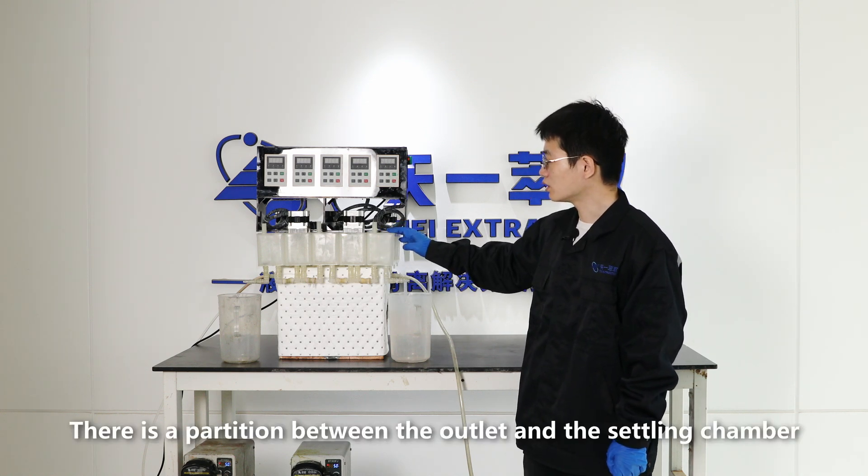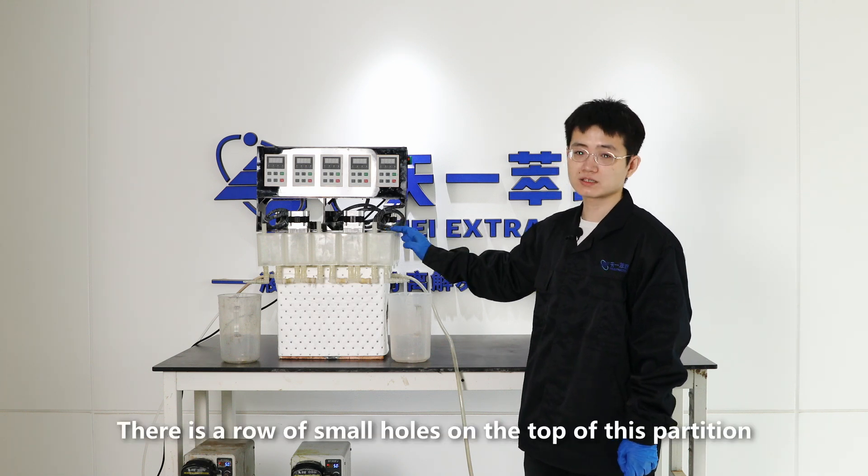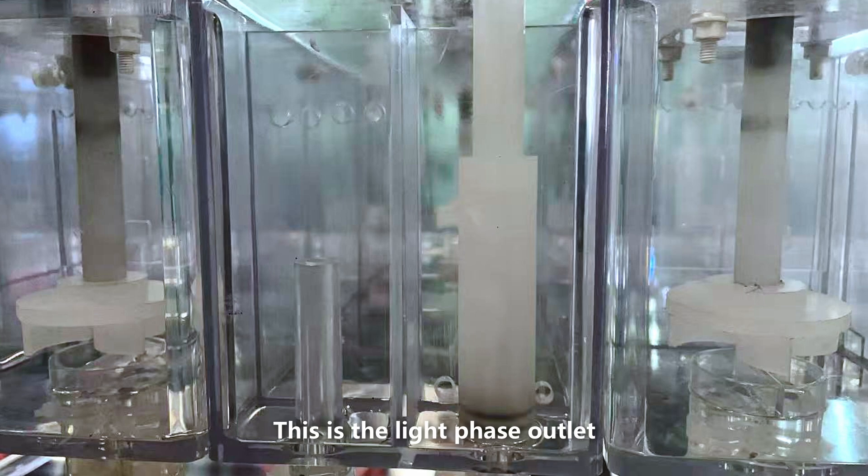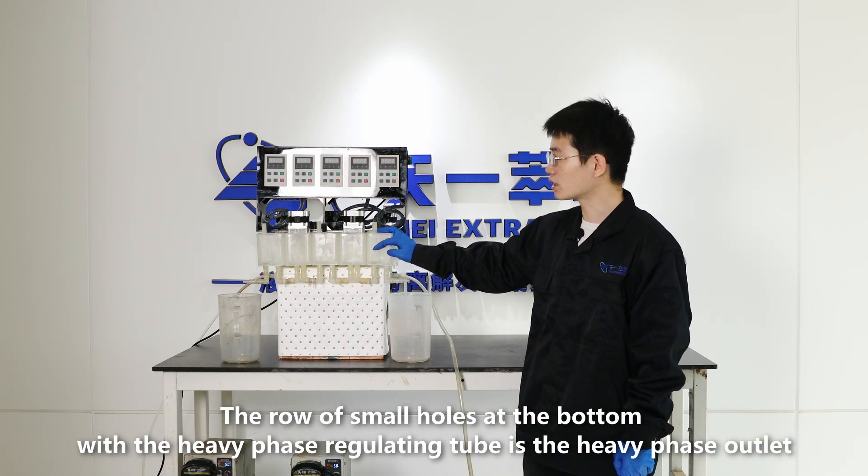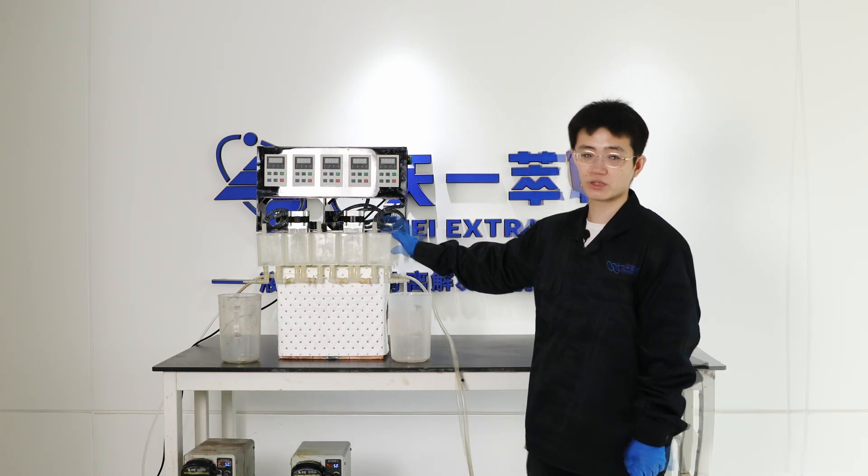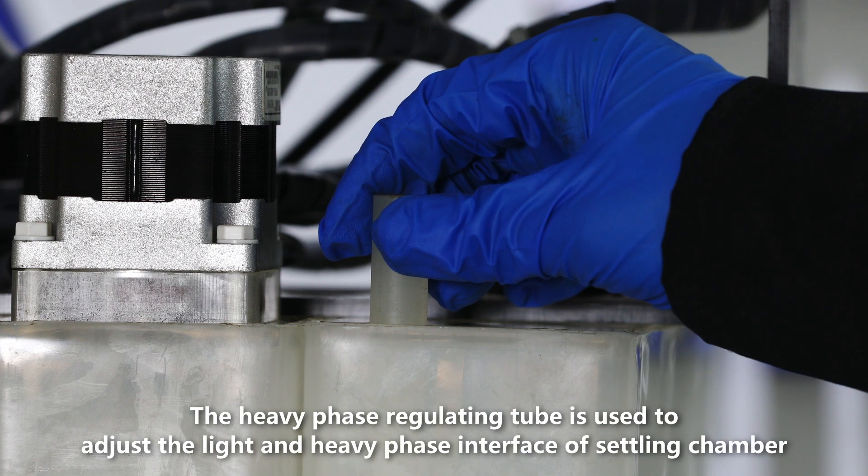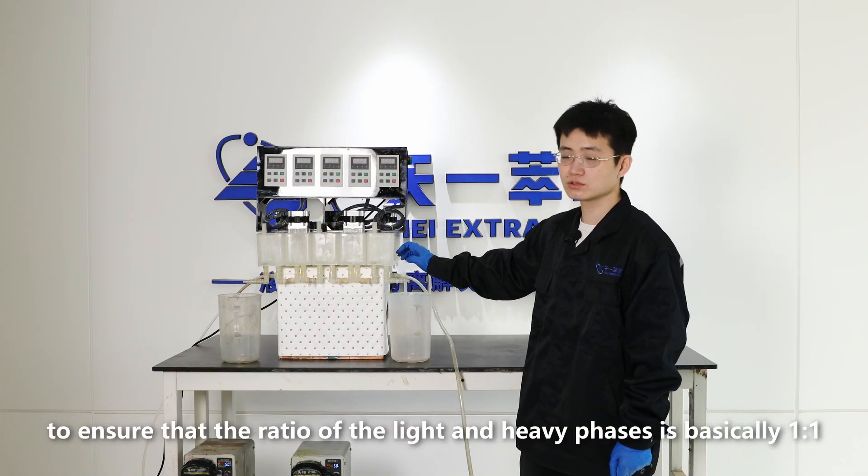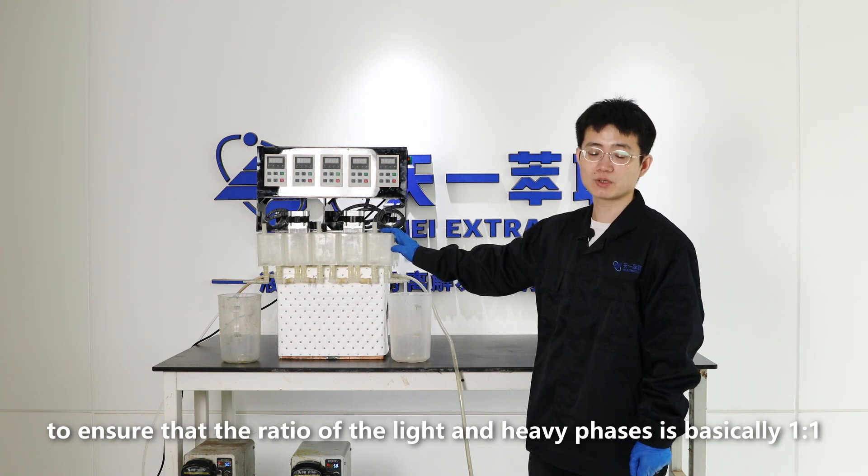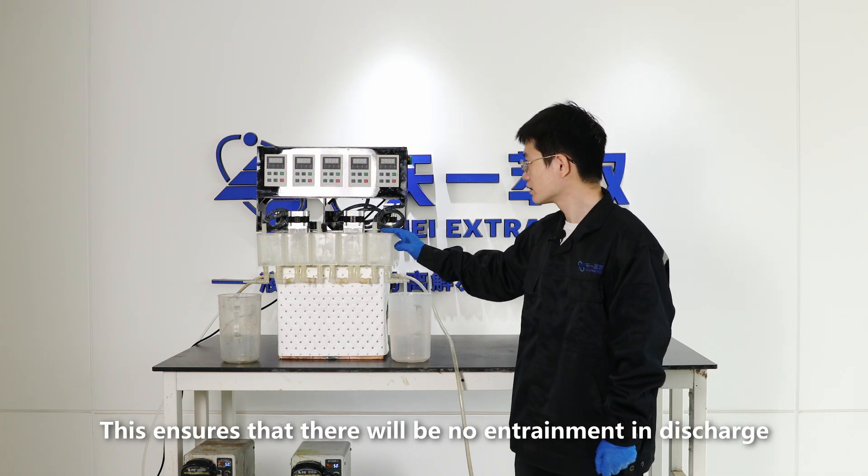There is a partition between the outlet and the settling chamber. There is a row of small holes on the top of this partition. This is the light phase outlet. The row of small holes at the bottom with the heavy phase regulating tube is the heavy phase outlet. The heavy phase regulating tube is used to adjust the light and heavy phase interface of settling chamber to ensure that the ratio of the light and heavy phases is basically one to one. This ensures that there will be no entrainment in discharge.